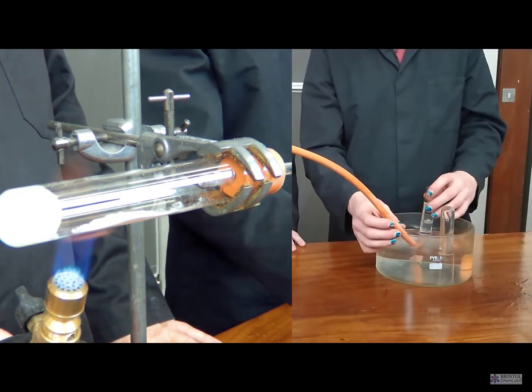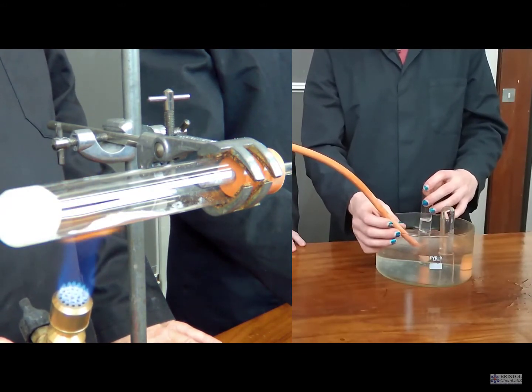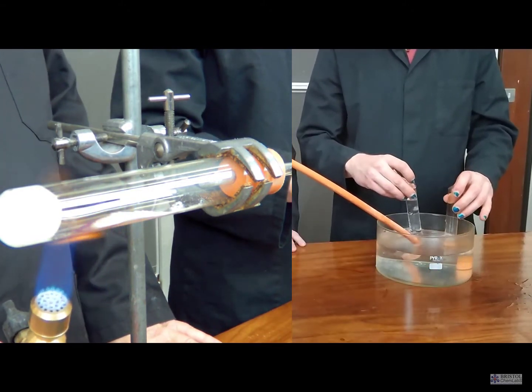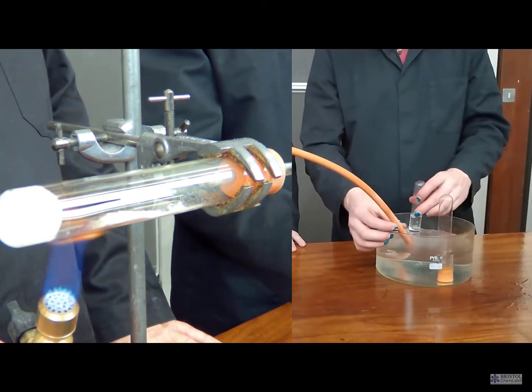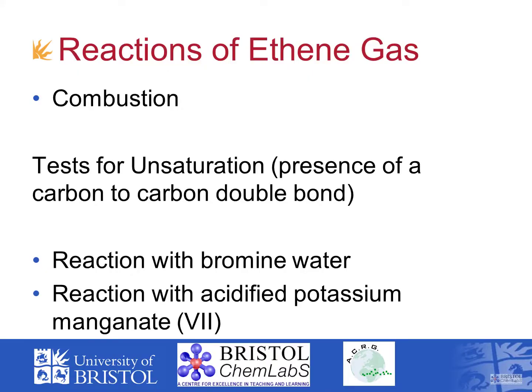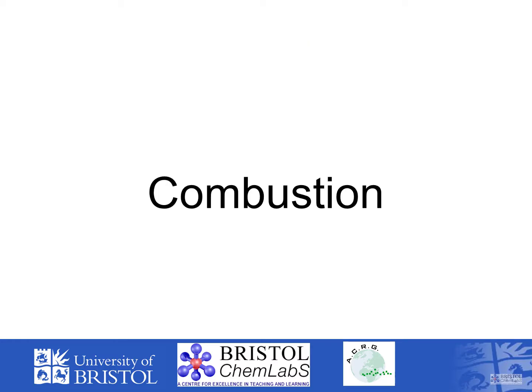The ethene gas can be collected by the downward displacement of water, and once we've got three or four tubes of the gas collected, we can then do some further testing. There are three standard tests for ethene: one is its combustion, second is to use bromine water to show the presence of a double bond—a test for unsaturation—and thirdly the use of acidified potassium manganate VII (potassium permanganate), also as a test for unsaturation.